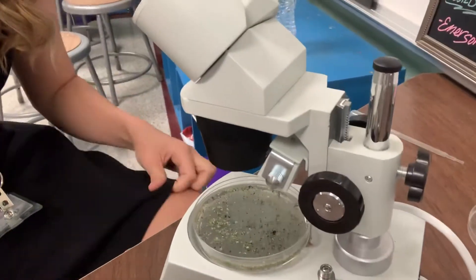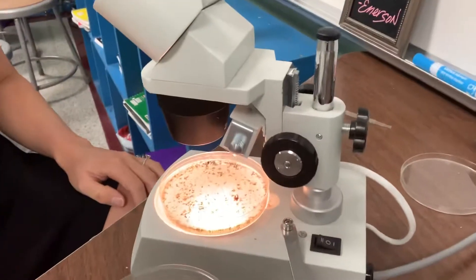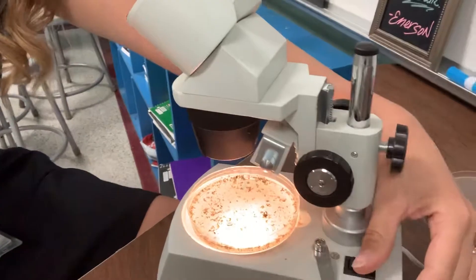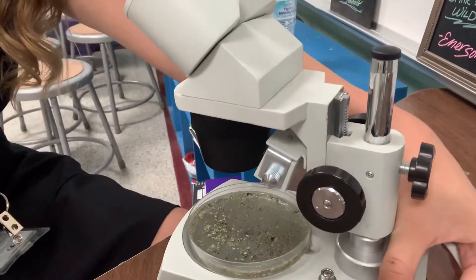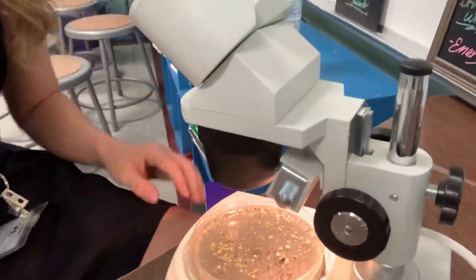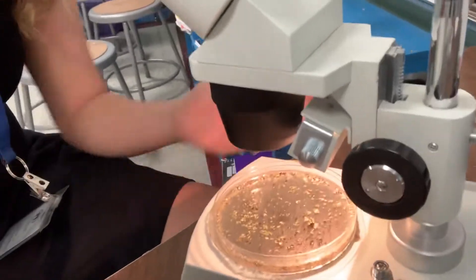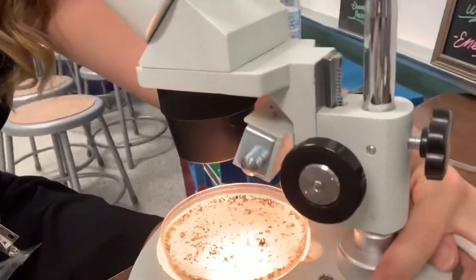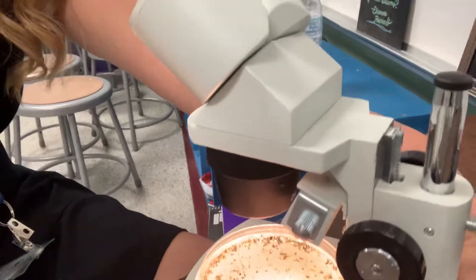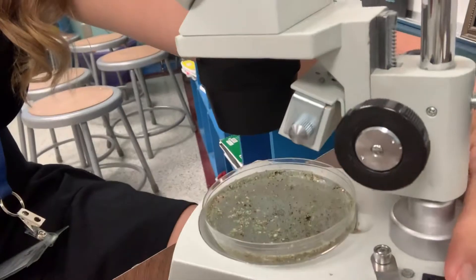There are two different ways you can use a dissecting scope: you can have the light on underneath it or the light above it. Dr. Miller has found that it's better to have the light above it and use a petri dish with a black background. I've found that I actually prefer it with the light underneath and no black background, but you can choose. Sometimes the lights from above are not bright enough, so you can always use a flashlight in addition to see it better.